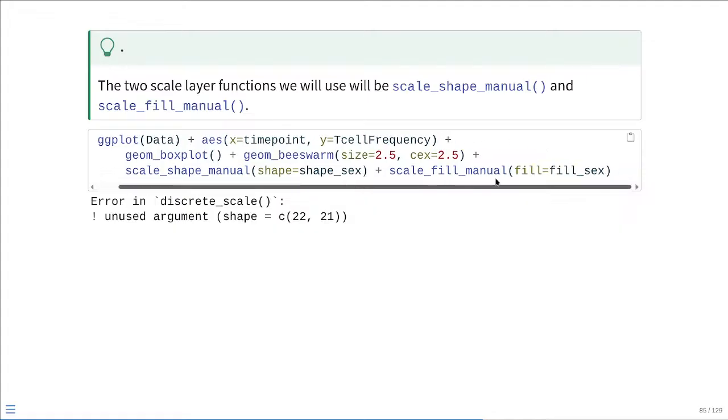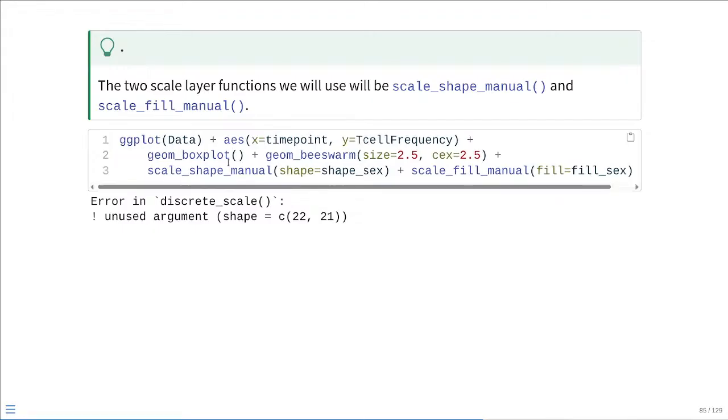So rather than have to scroll massively back and forth a couple dozen times just to see all the line of code that I wrote, if you leave a little plus sign on the right end of your ggplot line and then hit enter, the line will continue on as the second line. And as long as you keep adding plus signs, you can continue breaking this, what would be a huge line, into separate individual lines. And R will still treat this as one line of code. So you're still able to see it, which can be helpful to keeping things tidy, but it will still actually be running as a single line of code.